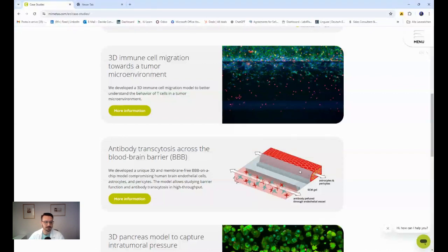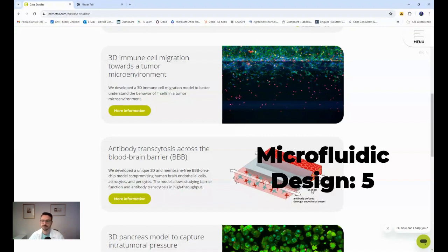So, depending on this, you will basically change the surface that is exposed to this internal channel. So you can have both vascularized, just one vascularized, having it filled with gel or with other fluid. So it's really a flexible kind of system in terms of fluidics, and the concept itself is also good. 5.